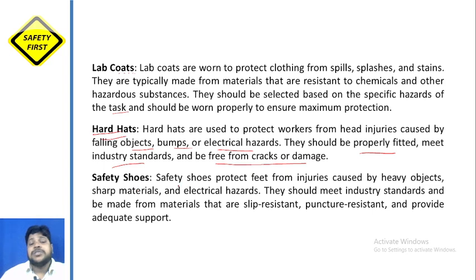Safety shoes. Many times we need safety shoes to protect feet from injuries caused by heavy objects, sharp materials, and electrical hazards. They should meet industry standards and be made from materials that are slip resistant, puncture resistant, and provide adequate support. तो ये जो इक्विपमेंट हैं सेफ्टी इक्विपमेंट, दे आर नॉट, we are aware about this. This should be standard और प्रॉपरली फिट होना चाहिए जो भी पहन रहा है उसको.